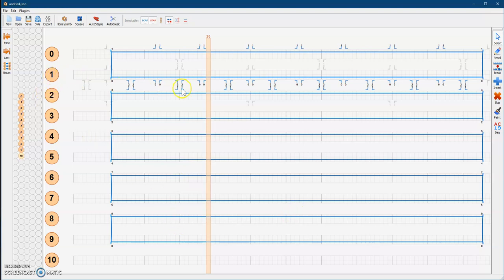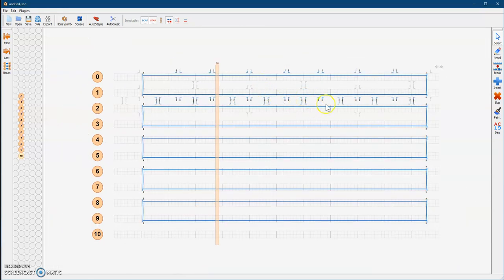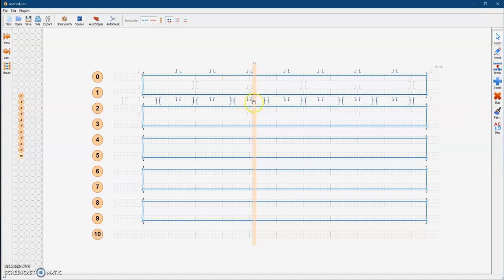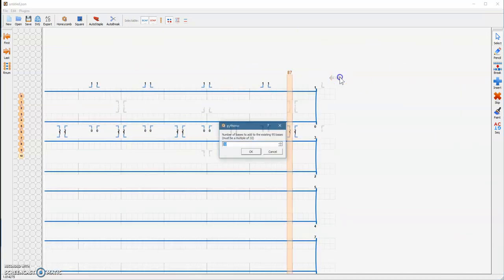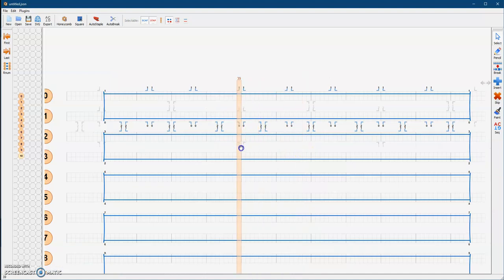What we're going to do now is use the crossover points on the 1 position because it's closest to 2. When it comes to shapes, I try to stay as symmetrical as possible. If you want to make this more symmetrical — you can see the center is around this area here — but we don't have a crossover point between 1 and 2. You could delete these crossovers and add more bases by clicking on the gray arrow, but for this tutorial we don't need to do that. We're just learning how to use these tools. So let's create some crossovers here.